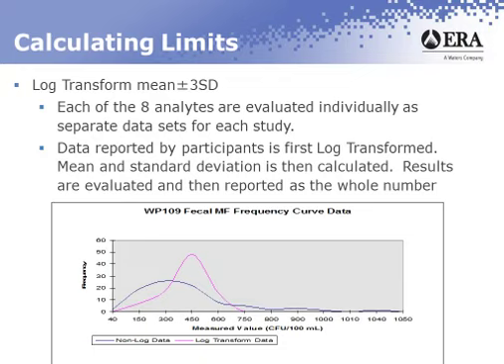So what you get in a data set like that is an arithmetic mean that's considerably larger than the median. So if you're going to evaluate this data set, in order to treat everyone fairly, you need to somewhat normalize the data set before you apply the plus or minus 3 standard deviation limit.